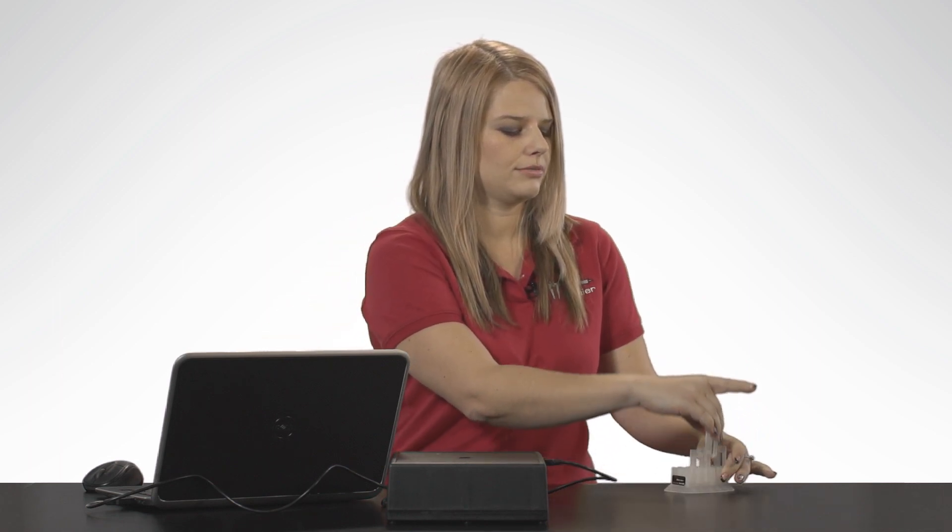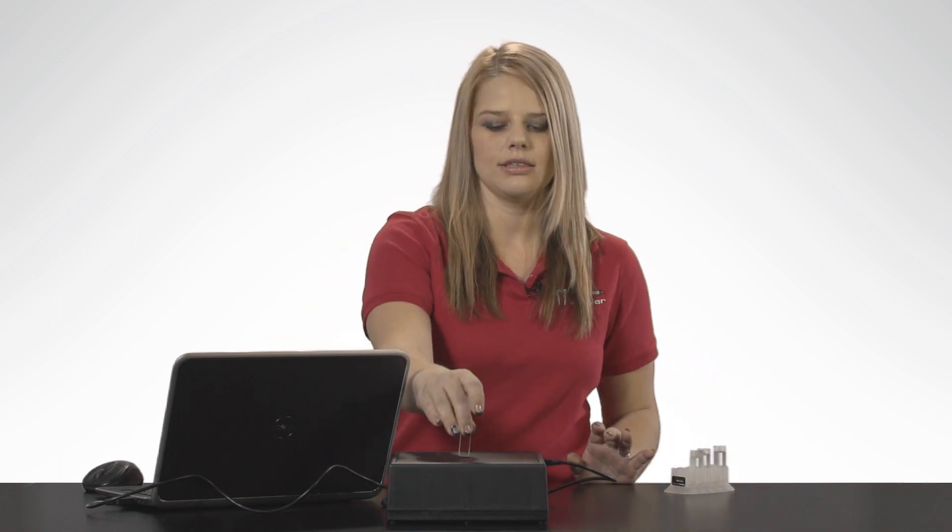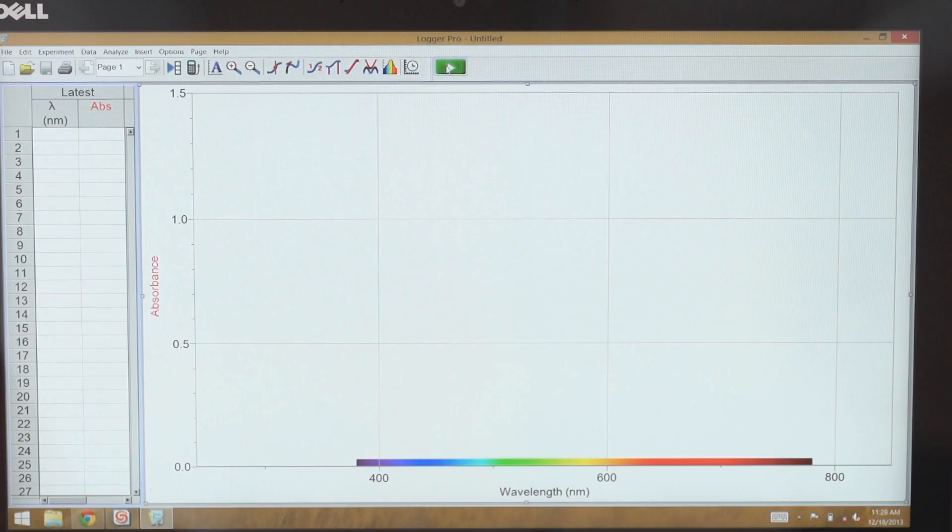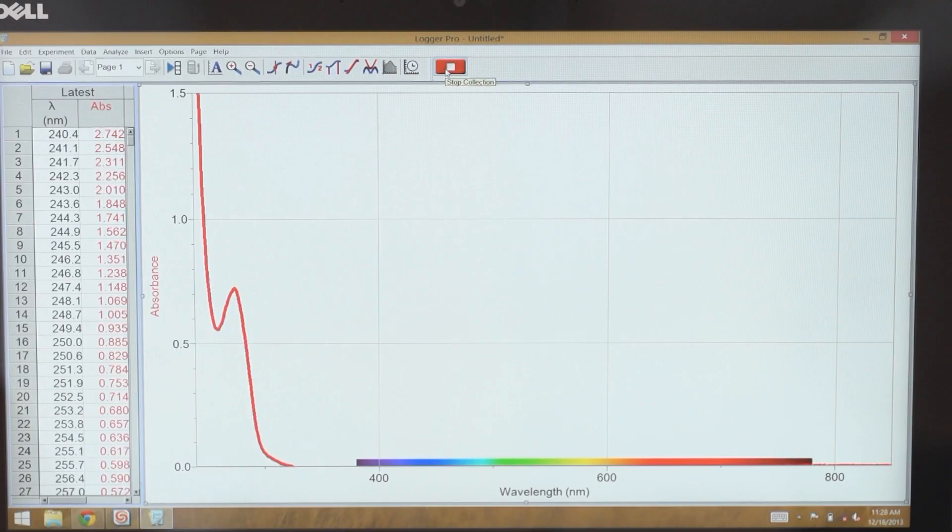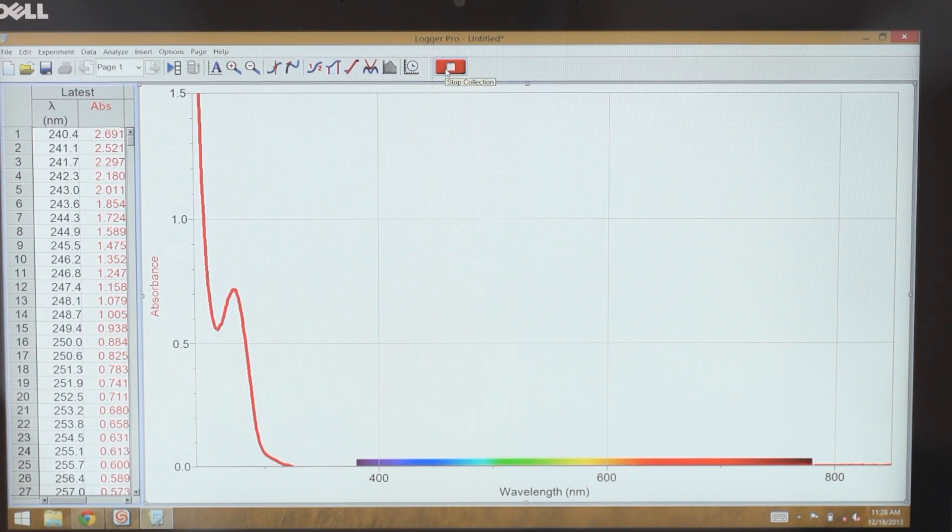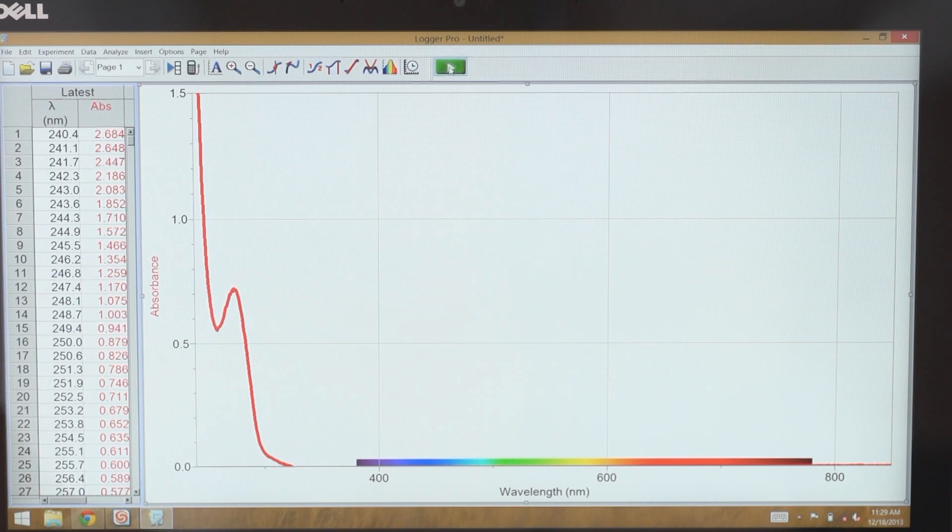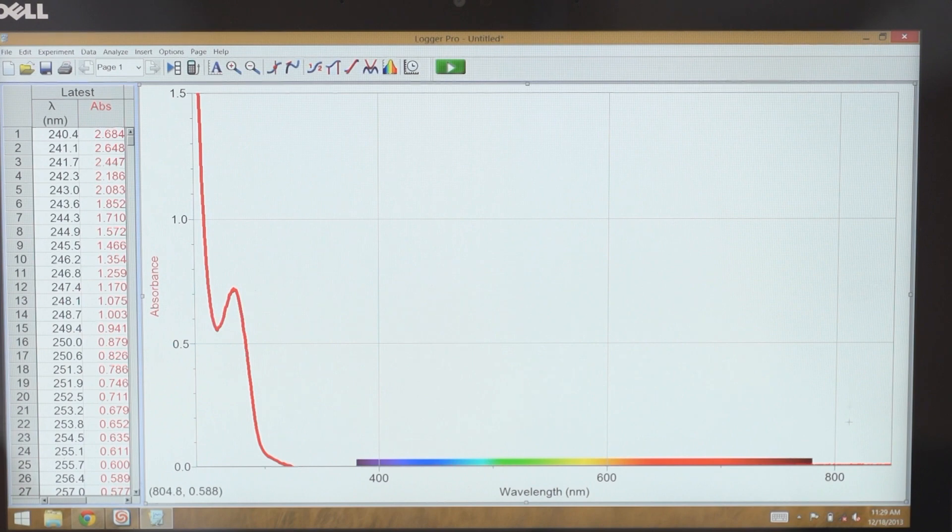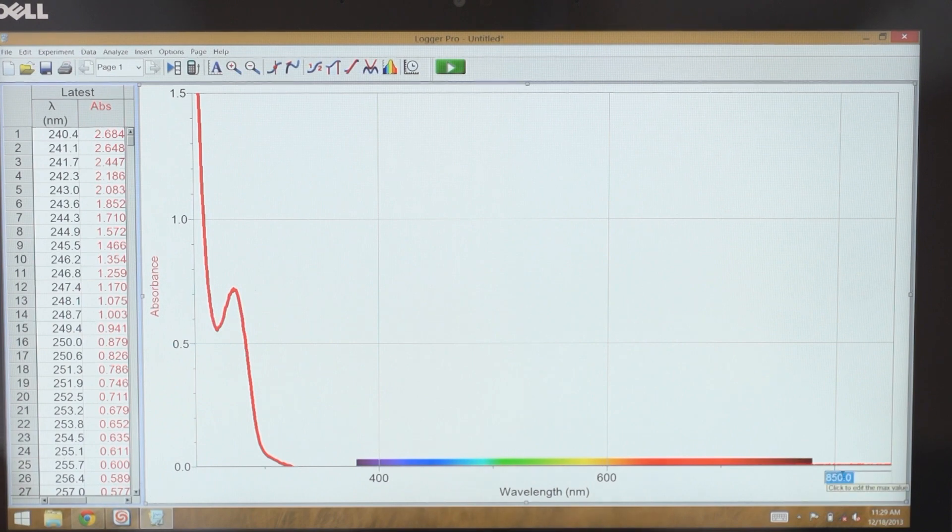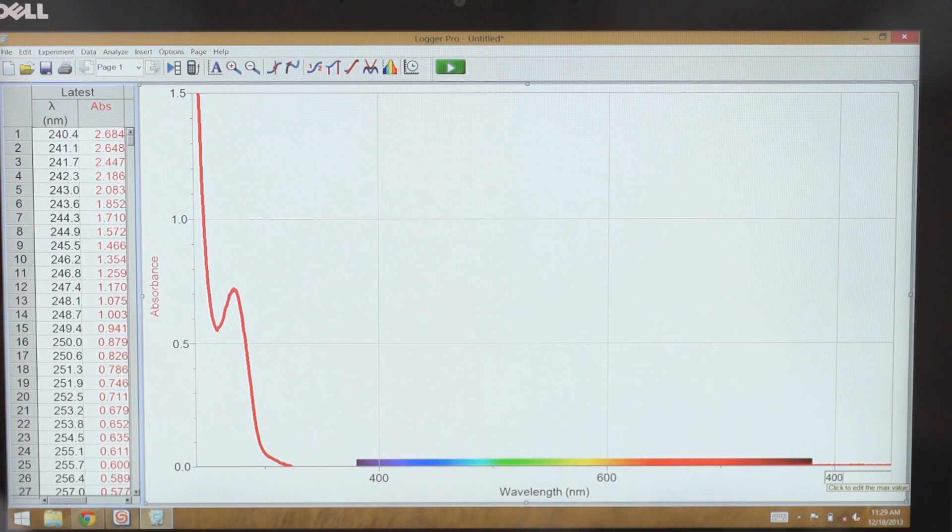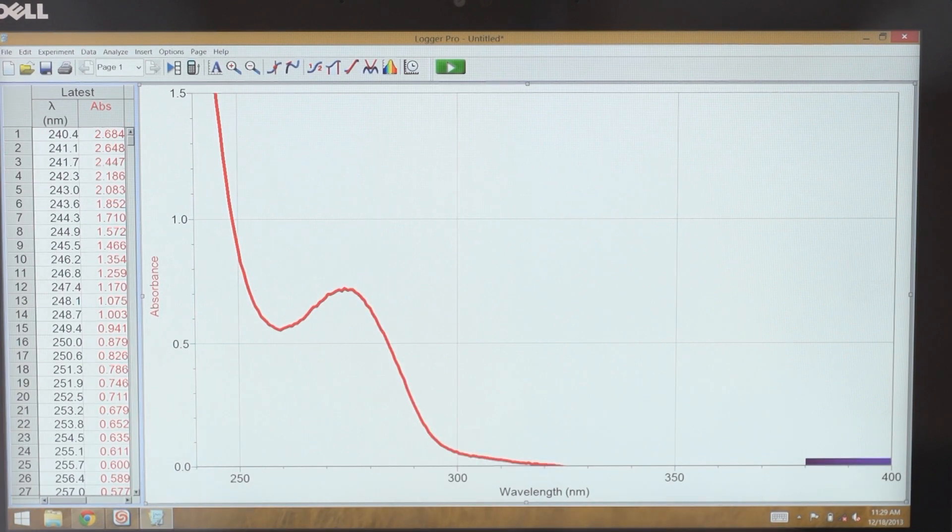To first take a spectrum, I'm going to put my absorbing sample in the spectrometer, and then press the Collect button. I should see my spectrum right away. Once I'm happy with my spectrum, I select the Stop button. And now I want to zoom in on this peak a little bit more. So I do that by tapping on the x-axis and typing in what I want my new range to be.